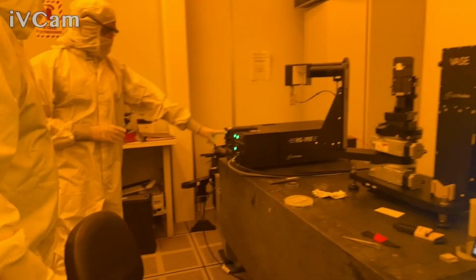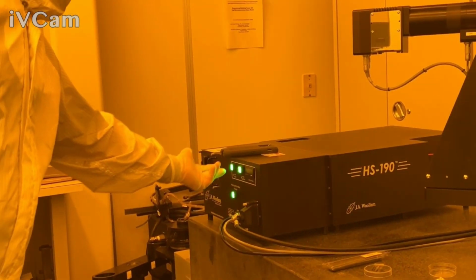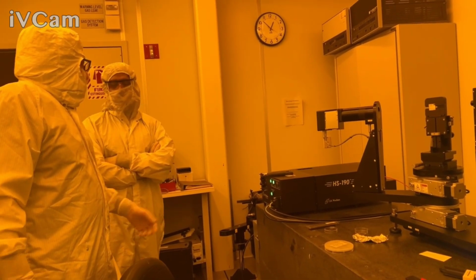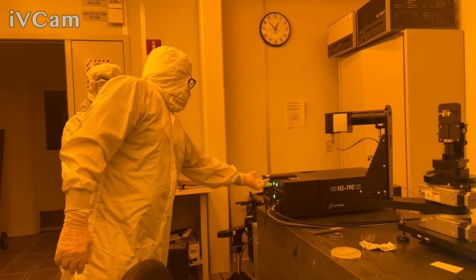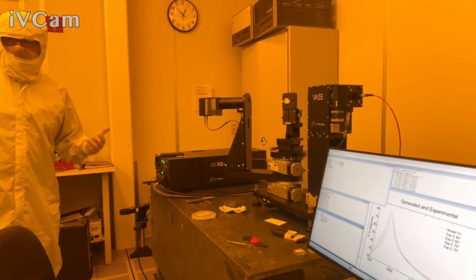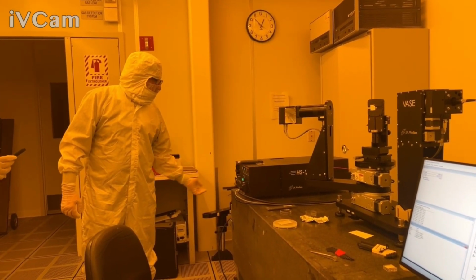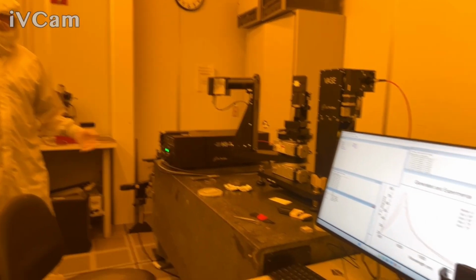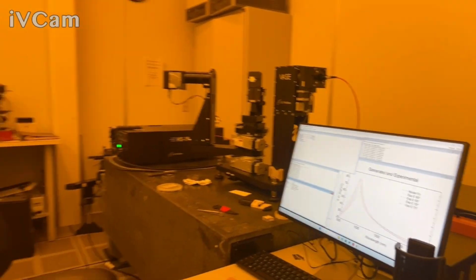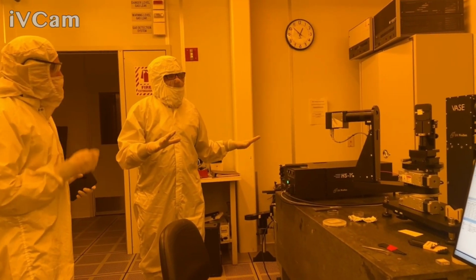Okay. If we're done taking measurements, we can just turn off here. You can turn off the whole box if you want, but it doesn't need to be. If you want to save lifetime for the lamp, we just turn that off. So if we're done for the day for measurements, we just turn that off so your lamp is off, and you can leave everything else on. That would be the only thing to turn off. You're welcome to turn everything off, but you don't really need to.